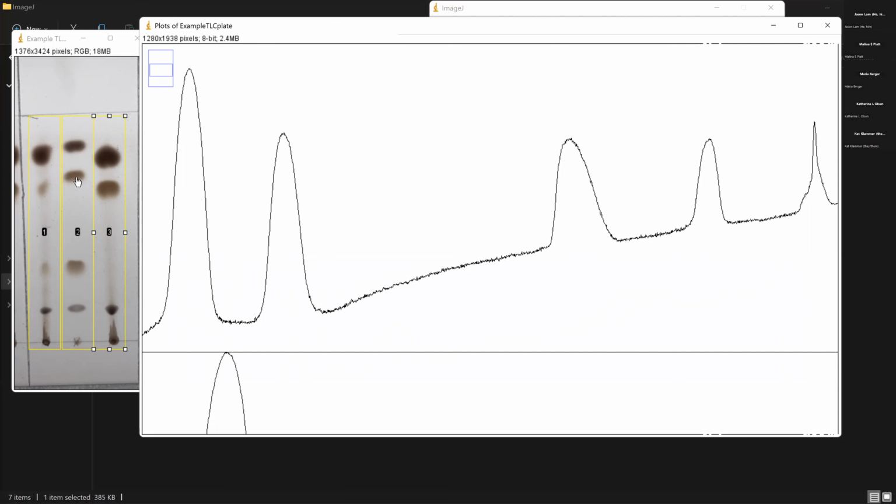This second dot here corresponds to the triacylglycerides, or triacylglycerols. It's going to correspond to this peak here. This dot here is fatty acids. It's corresponding to this peak. And then this dot here is corresponding to the cholesterol, and it's that peak. And then finally, at the very bottom, we have the phospholipids, which did not move at all and are going to correspond to this peak.